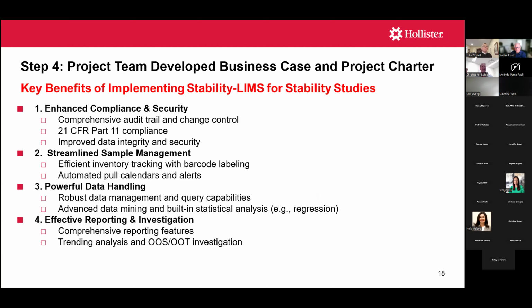So for our business case, we really relied on a lot of what the external consultant said during his audit, that we were at a risk of not being compliant. So that was one of the key things, enhance compliance and security. Such a system would have a comprehensive audit trail, change control, be Part 11 compliant. So it would really improve our overall data integrity and security.